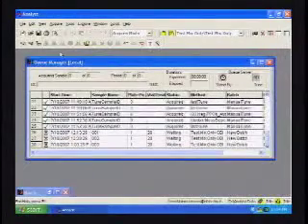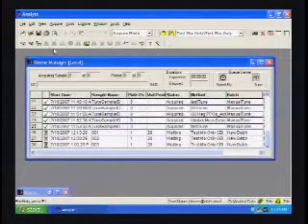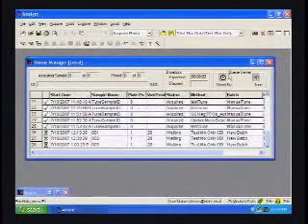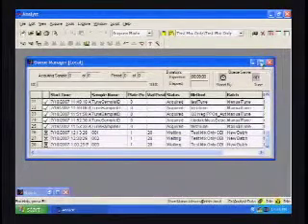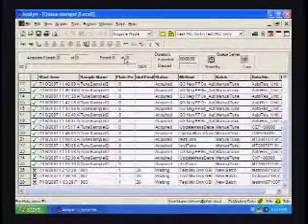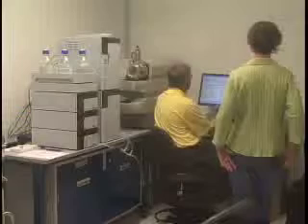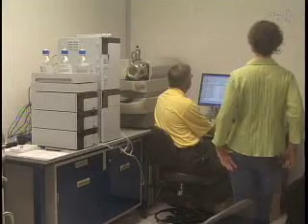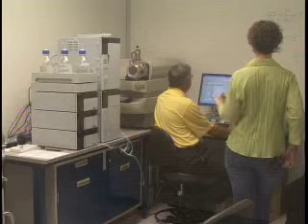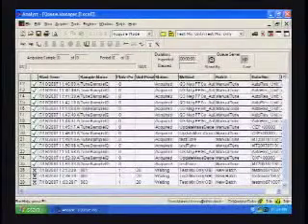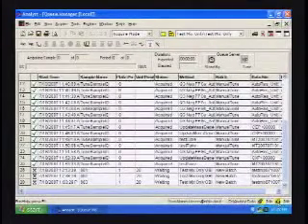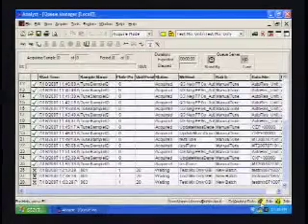The thing that we have to remember when we use the submit for the batches is that just because you submit it doesn't mean that it automatically starts the process. So at this point, we have to activate the system. As we can see down here in the right hand corner, everything's in yellow, which means it's on standby. So we want to get it to the green mode or the ready.